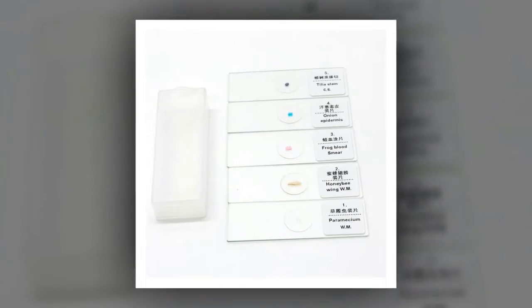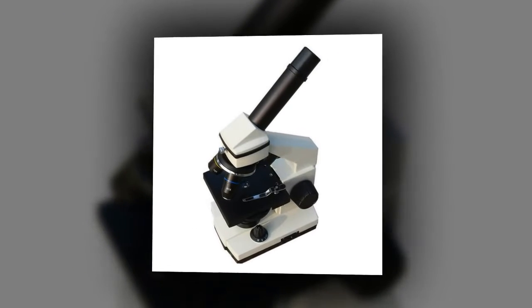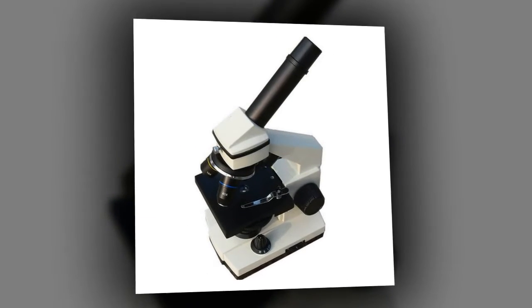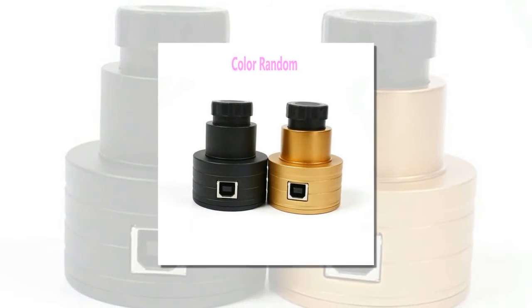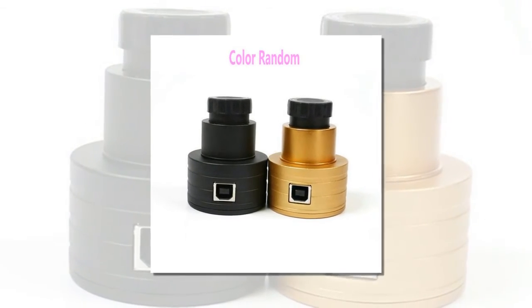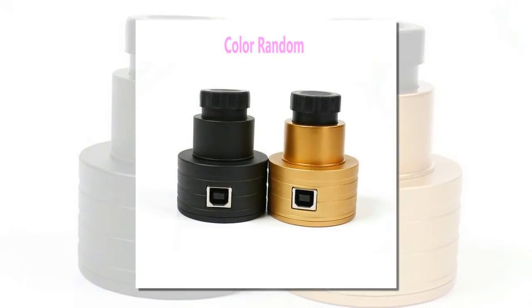It is also suitable for biological education and research at home. Eyepieces: WF10X and WF16X with wide field of view.